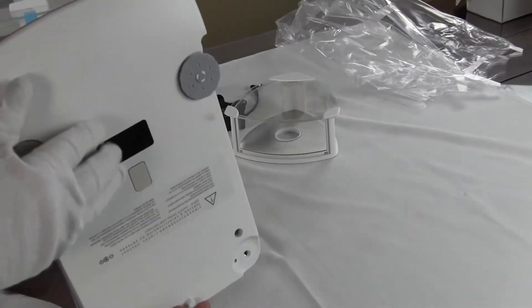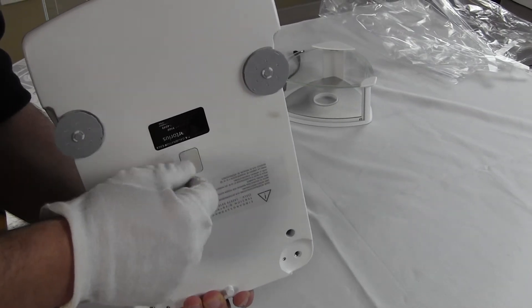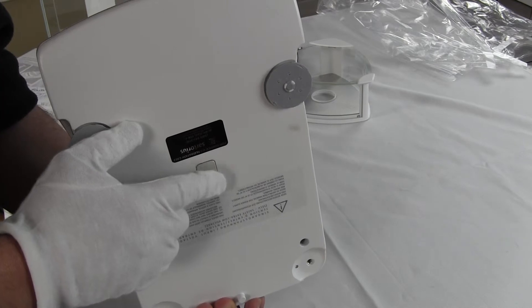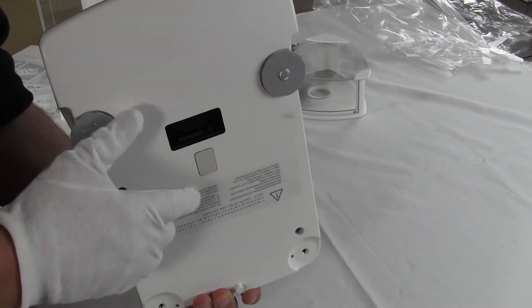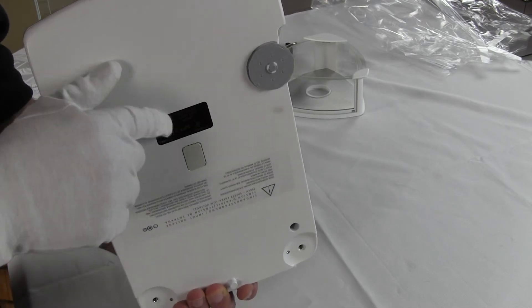On the bottom of the balance, we have here two adjustable feet. And this little port right here is for an underhook. So, if you wanted to do specific gravity of a magnetic material or something hot, that cap comes right off and there's an underhook in there.